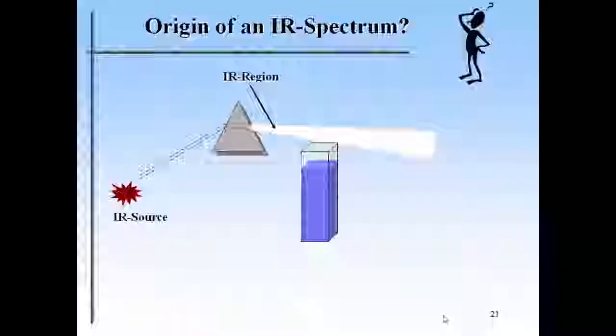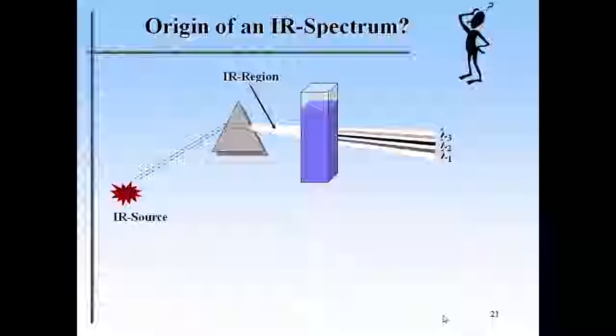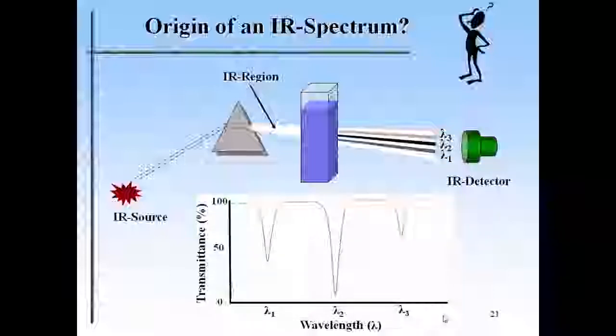The origin of the IR spectrum. So if you offer the sample a number of wavelengths or polychromatic radiation, it will absorb those wavelengths it needs in order to excite specific vibrations. And it will then absorb at these different wavelengths in different ways simply because there are different excitation conditions or different oscillators absorb differently.